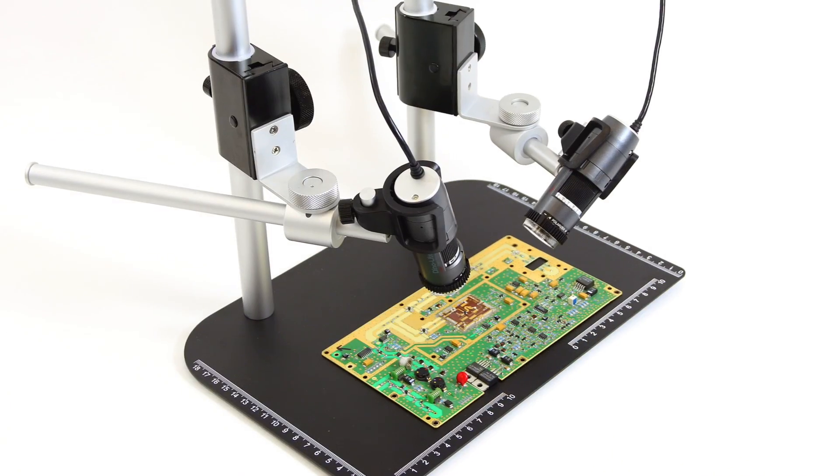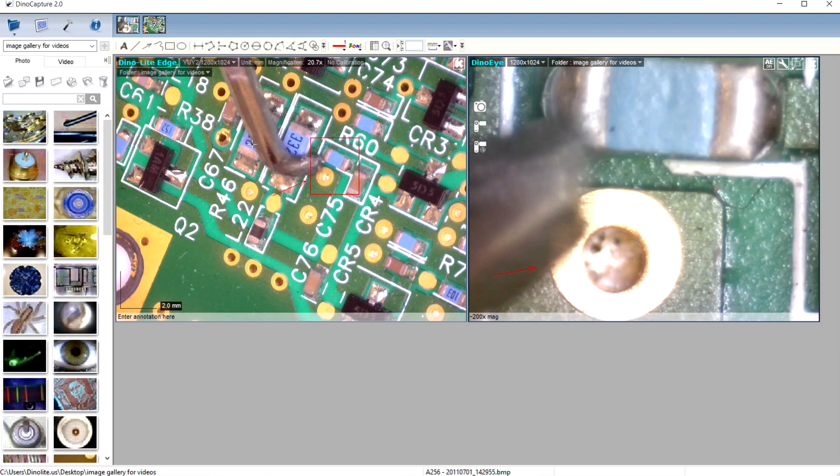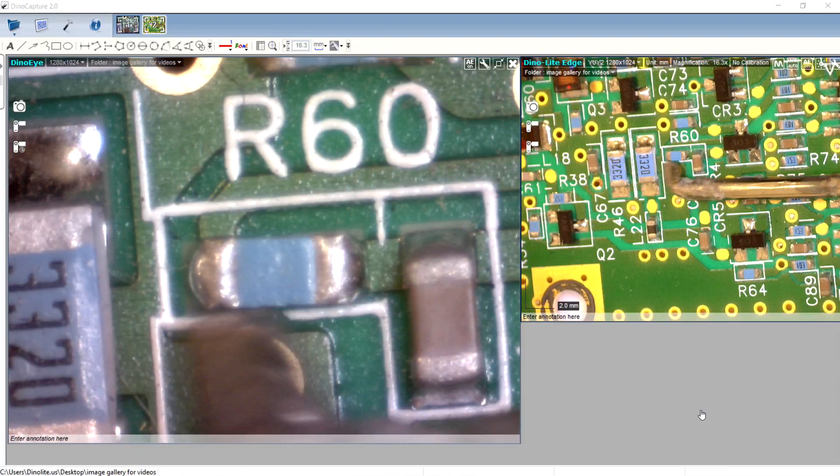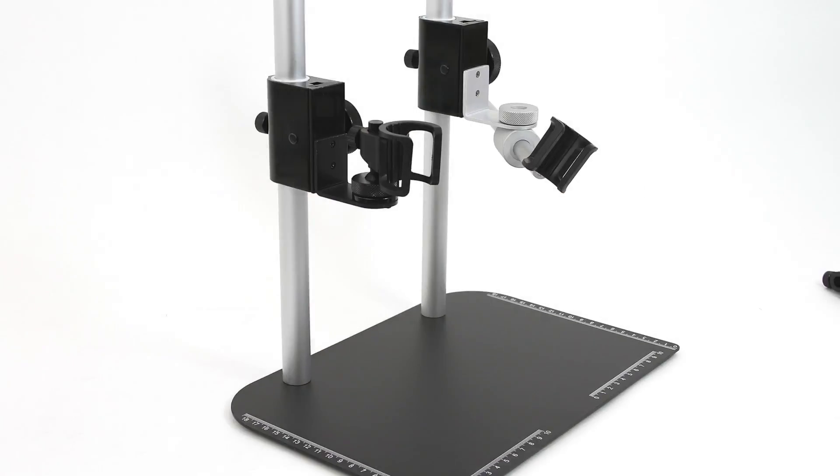The MS37B is a great option for users who require inspection with two Dino-Lite microscopes as well as viewing at different angles.